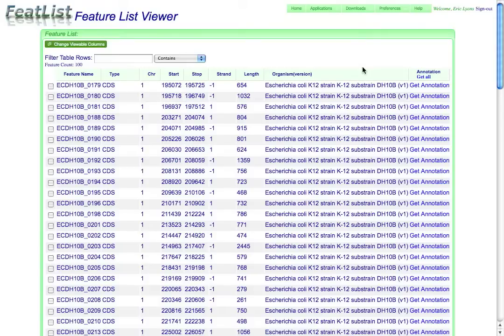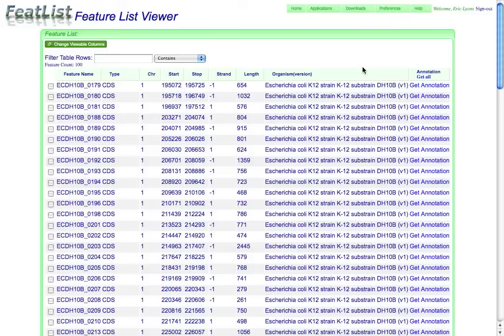You can get to this tool using a variety of other applications within Koji, and this tool allows you to manage and go through lists of genomic features such as genes or protein coding regions.